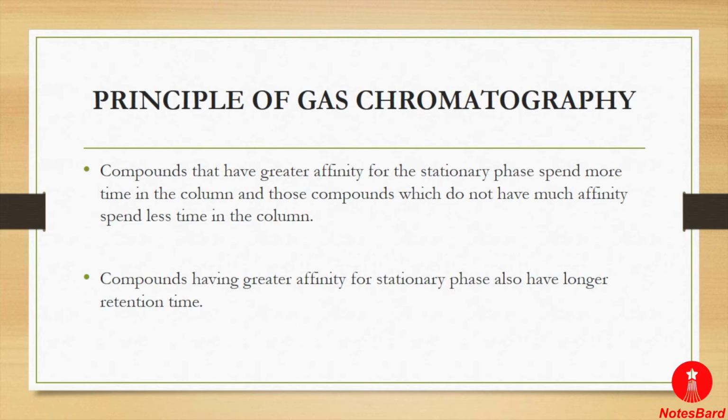In gas liquid chromatography, where the stationary phase is liquid, mobile phases like helium, argon or krypton are used because these gases are inert in nature. They cannot react with anything, and helium is most often used for gas chromatography because of its low molecular weight. The stationary phase is a high boiling point liquid adsorbed onto a solid. Like other chromatography methods, the mobile phase, which is the gas, is a chemically inert gas like helium, krypton, argon and many others.